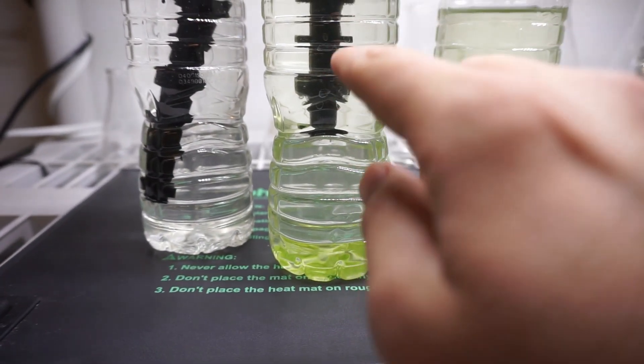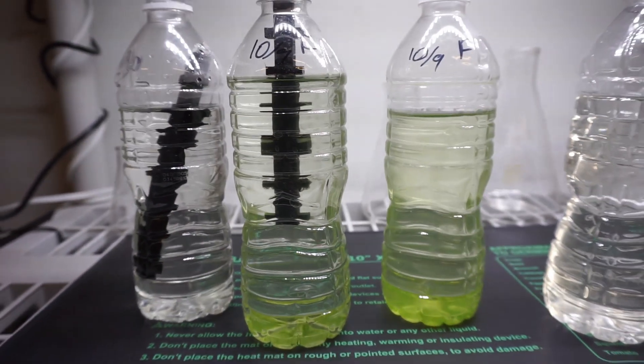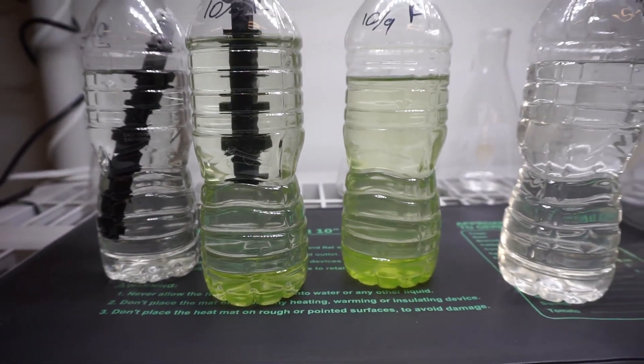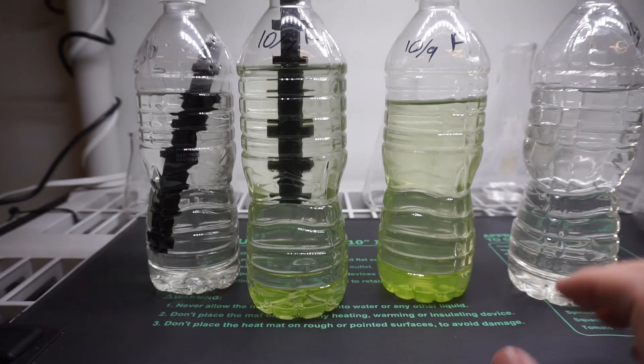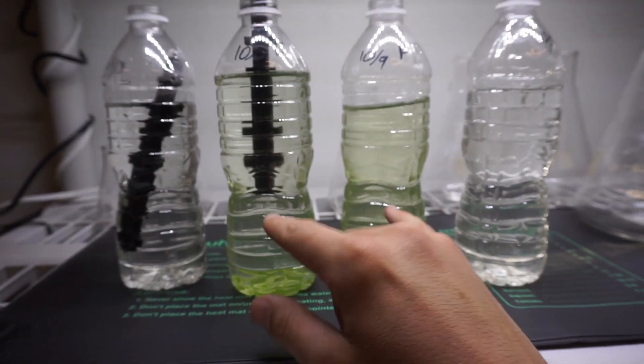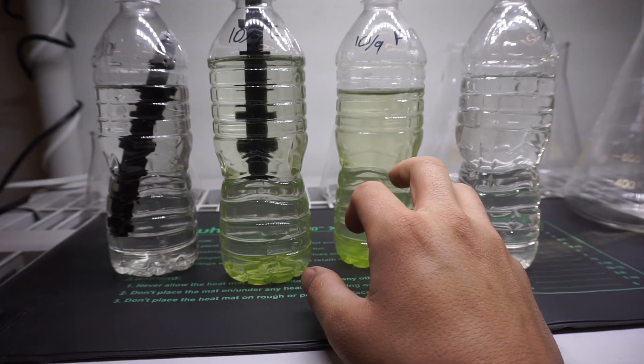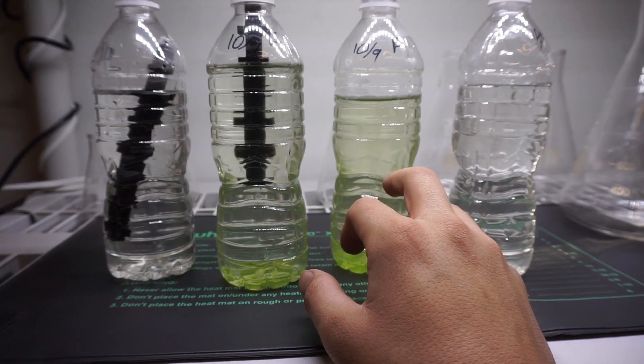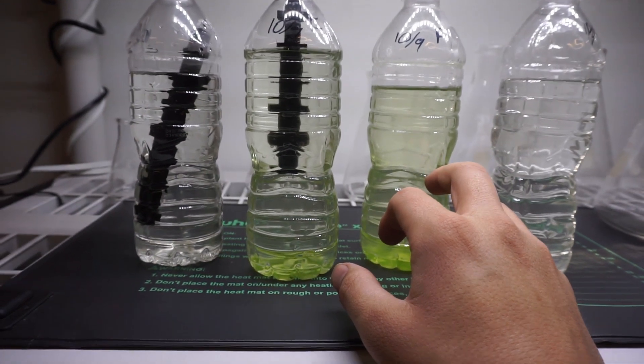Of course it's difficult to see through the plastic, but I can definitely tell that on each of those little shelves there's some biomass accumulation. So we'll give these guys another week here, and there's roughly 400 milliliters in each - we lost a little bit, this one's probably got about 350, 325 in it now.